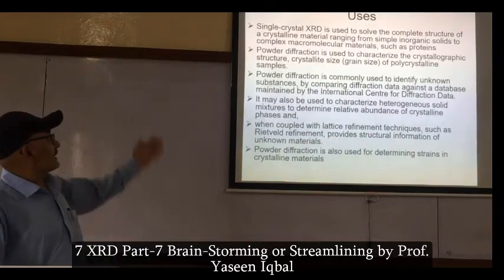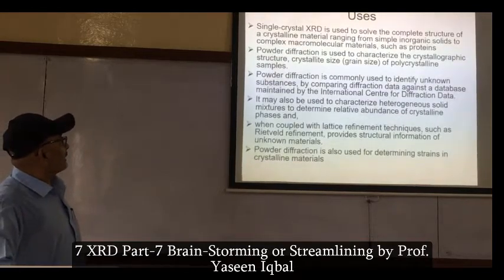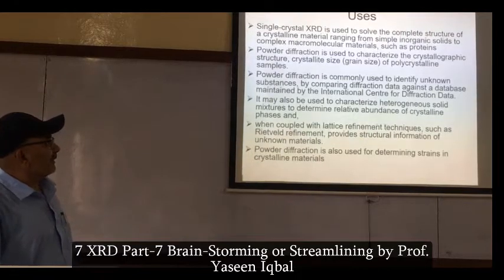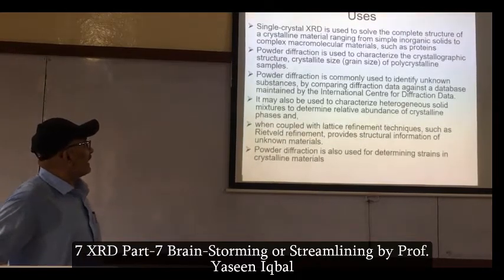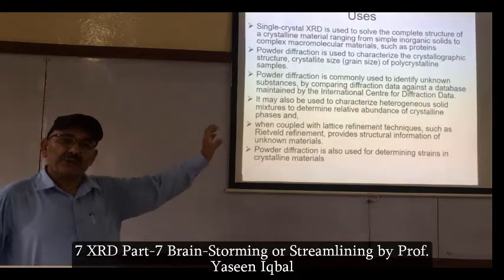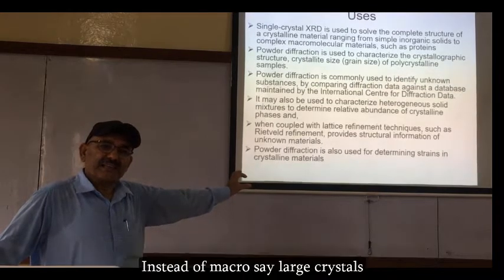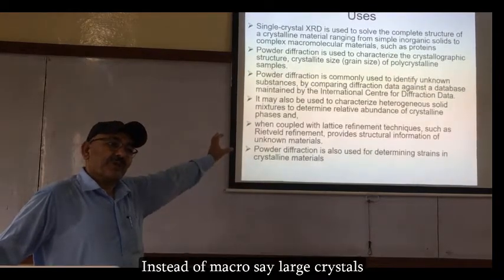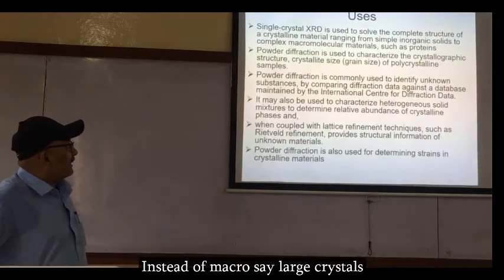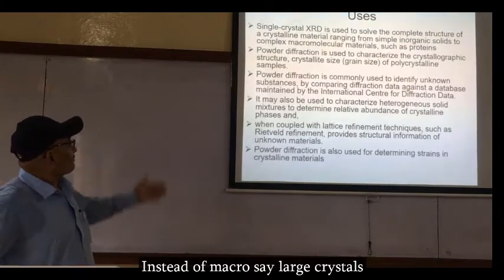Single crystal X-ray diffraction is used to solve the complete structure of crystalline materials, ranging from simple inorganic solids to complex macromolecular materials, right? When I told you about small angle X-ray scattering, that is used for macromolecular materials such as proteins and many organic materials.